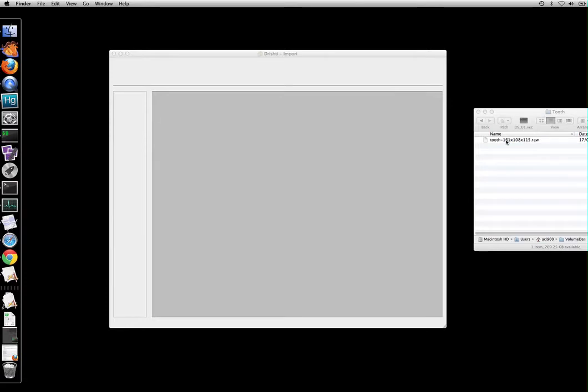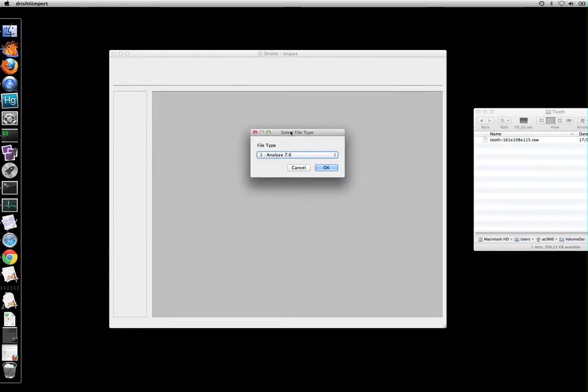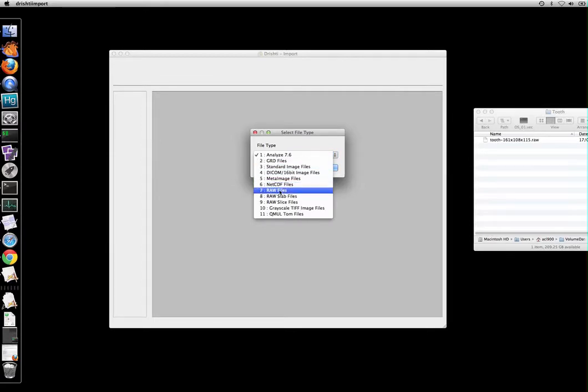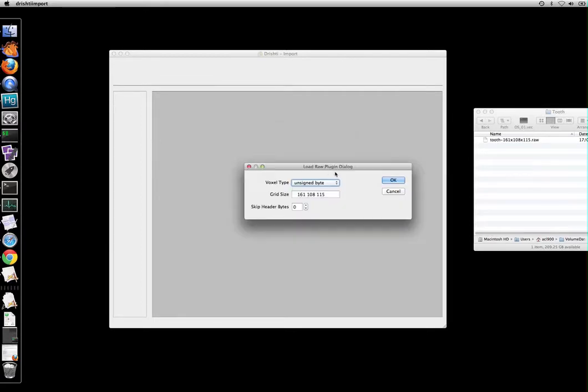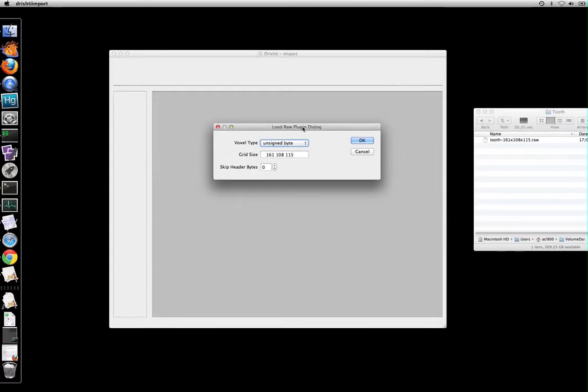Let's load this data set. It's a raw file, so when you drag and drop the file it will ask you what file type it is. Same with the directory. Now in this case we know that it is a raw file. This file has a 13 byte header where the first byte is 0, so it is taken as unsigned byte or unsigned character voxel type.